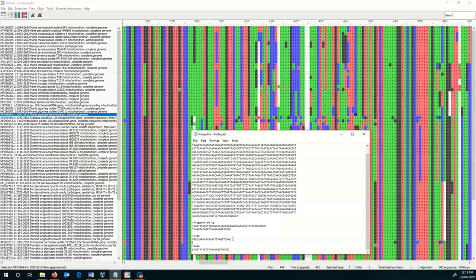I've written down the primers that I would make to use in those two positions. So for the forward primer, it's just the same as the sequence we find here. So you can just basically cut and paste it. The only thing I had to do was, because there's some variation in here, so here it's sometimes a C and sometimes a T, depending on which species it is.